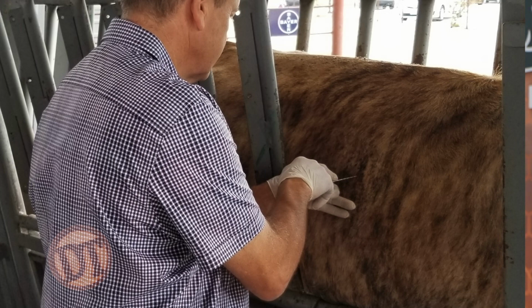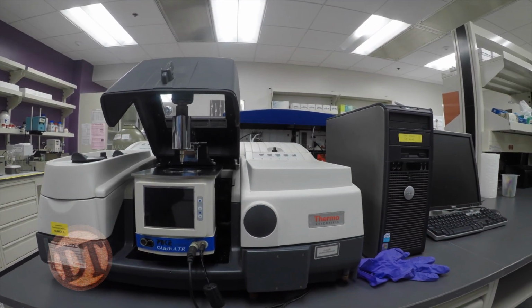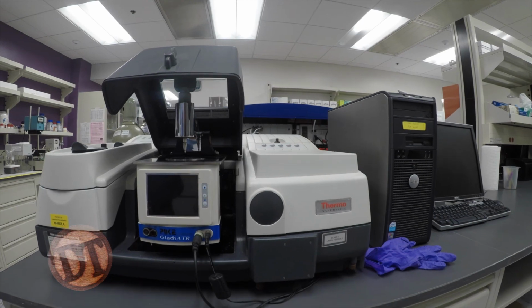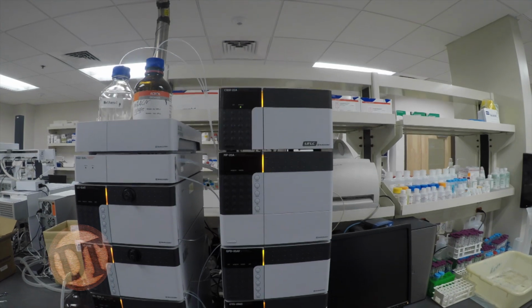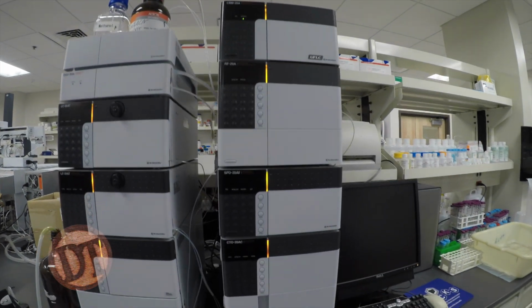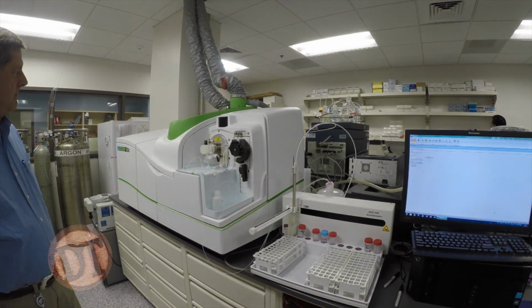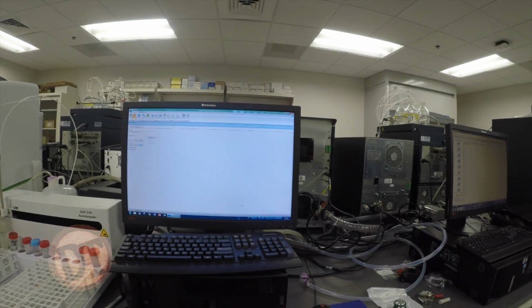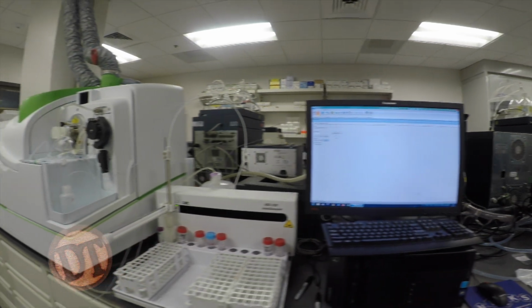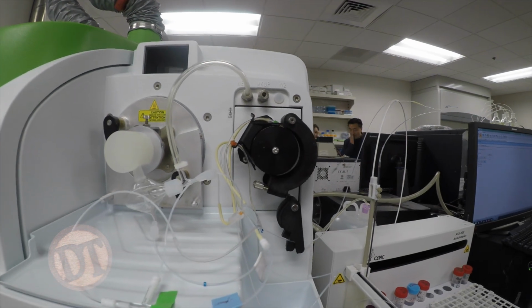So a lot of it really goes back to the equipment that it takes to do the analysis. The machines that we use are very expensive, and the technology really has been available maybe for the last 10 years. At Iowa State, we had three of these ICP mass spec machines because we did a lot of liver biopsy samples. At Manhattan, we have one, and as we get busier, I'm sure we'll use more. But it's been a real good tool to look at how nutrition is involved in how animals respond to normal challenge or how they respond to vaccines.